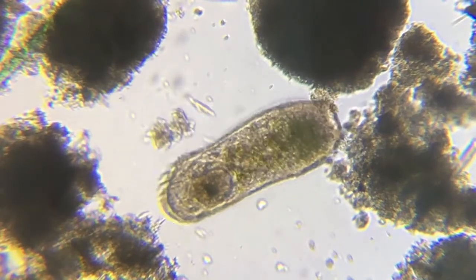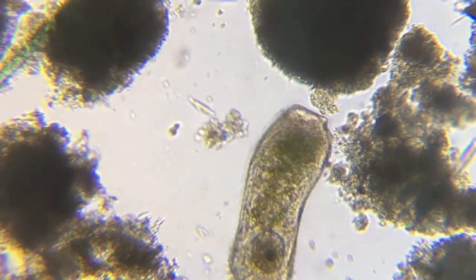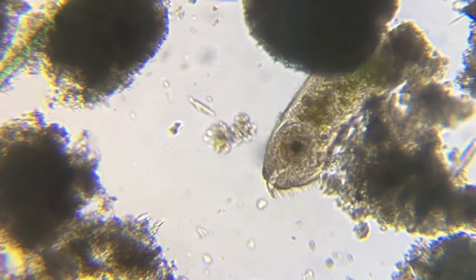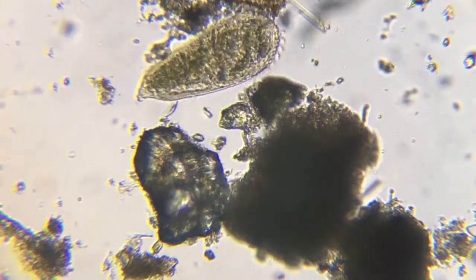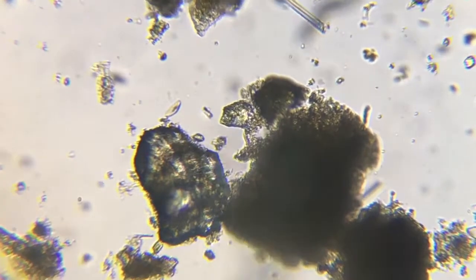Here are some clips of paramecians. The tiny tentacles you see around them are called cilia, and they use these to navigate for prey or food.